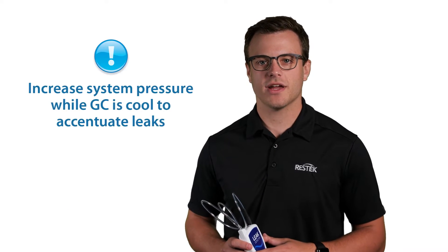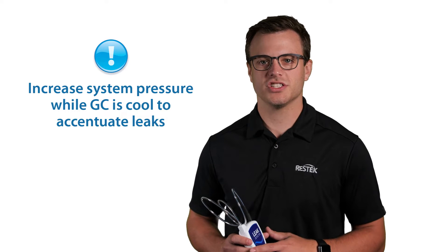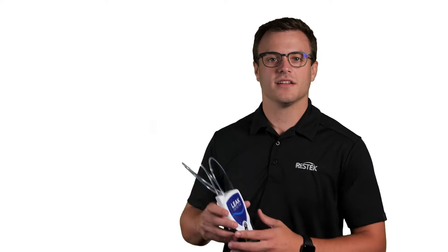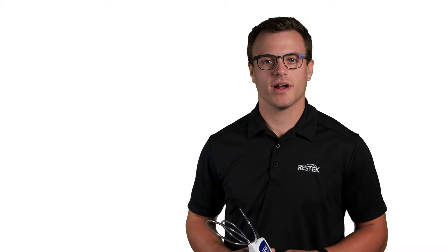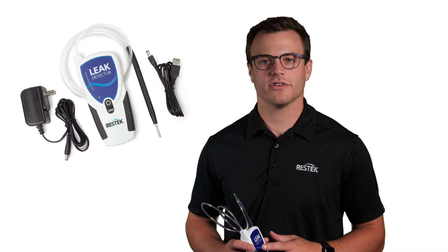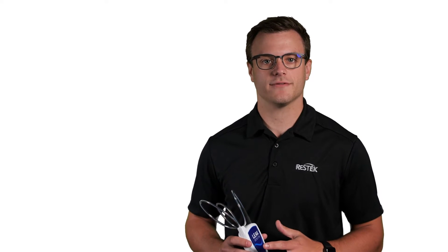Let's get started. Prior to leak checking a GC, we recommend you increase system pressure while the GC is cool to accentuate any potential leaks, making them easier to detect. You will also need a leak detector. Today, we'll be enlisting the help of ResTech's electronic leak detector. These tools are huge time savers and are very effective in helping you troubleshoot and maintain your gas chromatograph.